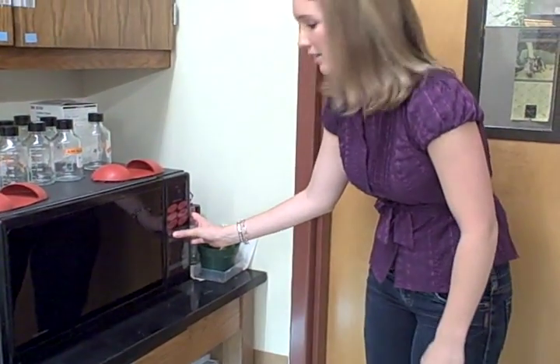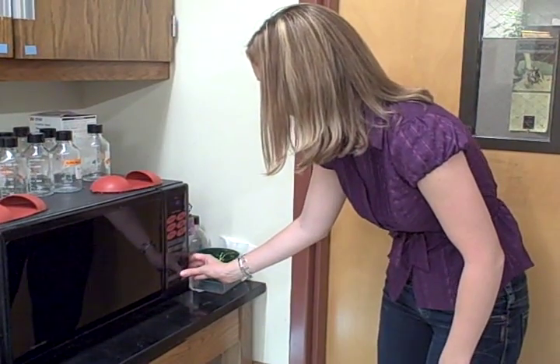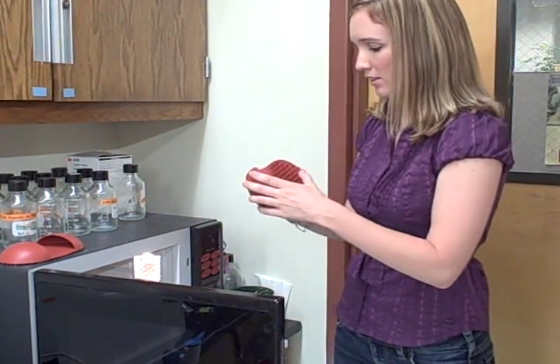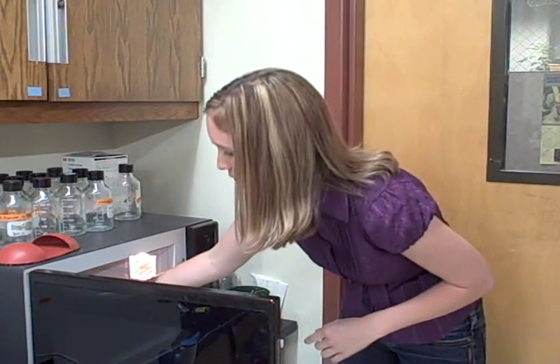I'm going to time it for a minute and then we're going to check it to see what it looks like. It's been a minute, so we're going to check on our Agarose solution. I'm going to make sure to use one of these so that I don't get burnt. It should be pretty hot. Let me take it out.